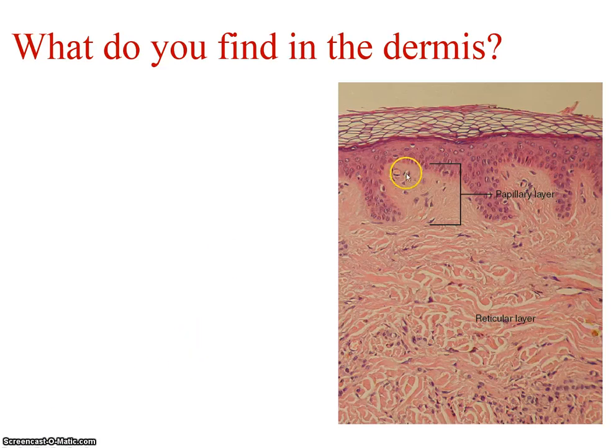Okay, so here we pick up on the second layer of the skin, the dermis. Right, so the dermis is quite a bit thicker. Here's a slide of skin, so you really get this perspective. So from these are papillae, which a papilla is always a bump, right? So from here to here is epidermis, and this is of course all this stratum corneum. It looks very flaky when, after you run it, you section it and you stain it.